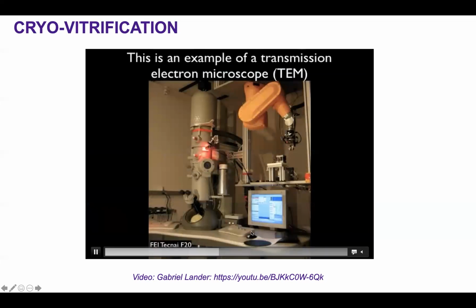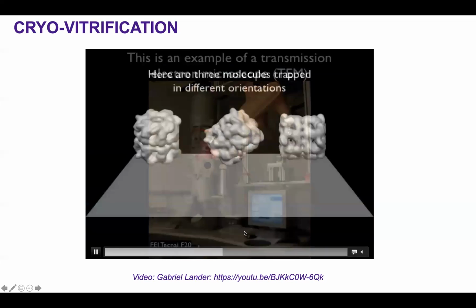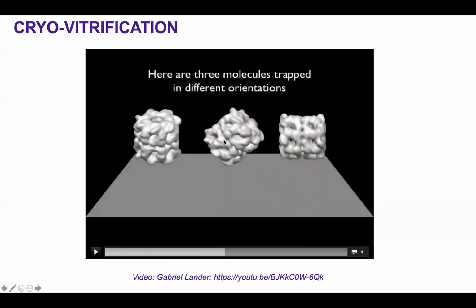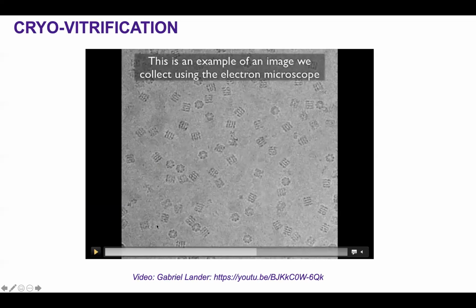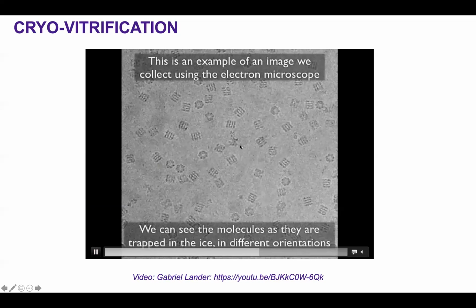And once you image under the microscope, if you have 3 different orientations of these particles, you start to see slightly different projections. That means they have random orientation, they produce different projections, which means if you have this kind of TEM image, now you can categorize them. You can see that, for example, these particles have similar orientation, whereas there are other particles, like here, that have a different orientation. So you can classify them and group them together.